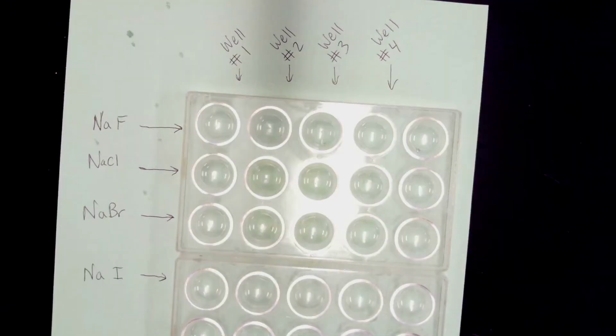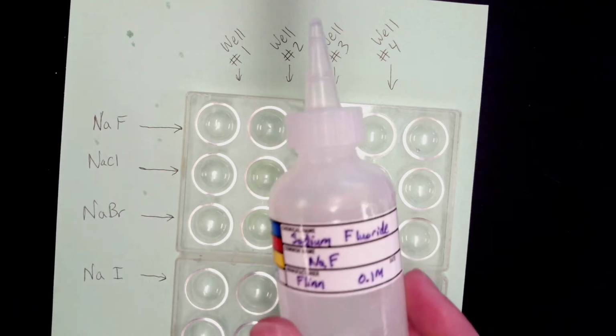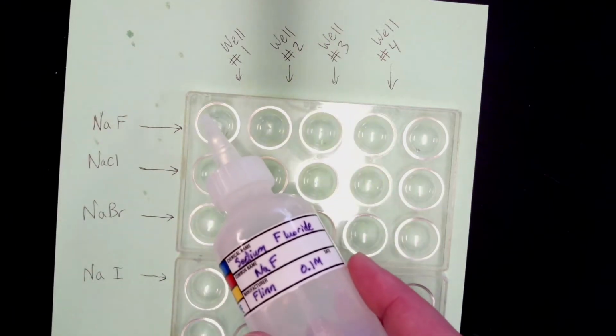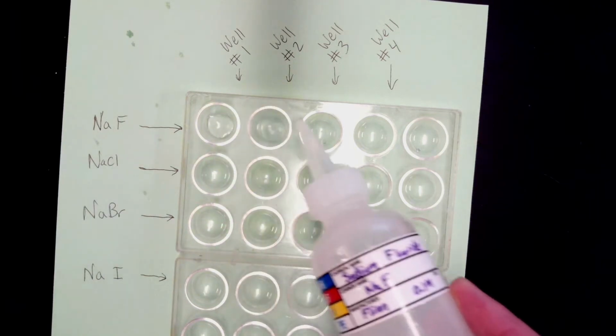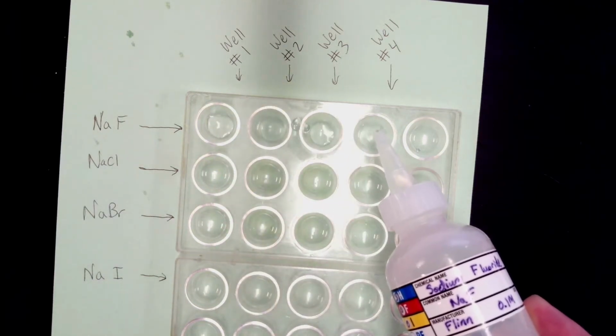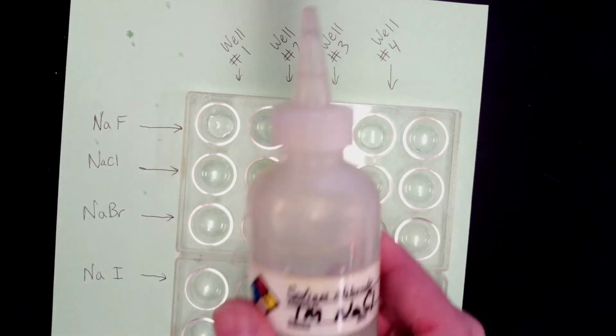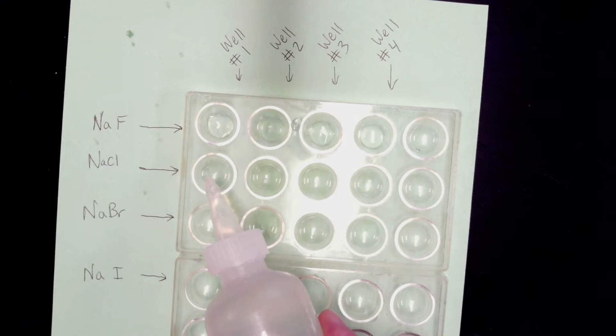So what we're going to do first is put the sodium fluoride across the top 4, then sodium chloride in the next 4, and so forth. Just get it all set up so that when we mix the compounds along the top, going down the columns, it's ready to go.